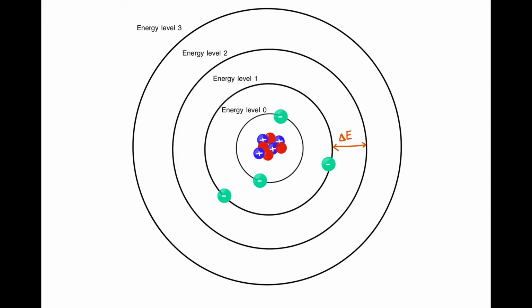For a single element, there could be multiple wavelengths of light emitted. This is due to multiple electron transitions which can take place from a higher energy level to a lower one. The diagram shows the energy gap between the two energy levels for one possible electron transition.